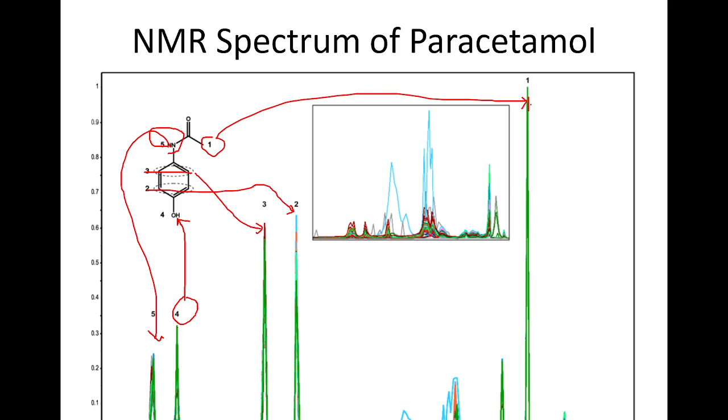And we know that one, we don't talk about the first one. Second and third, okay, we talked about ortho, which is more deshielded because they are ortho to this group. And the OH group is electron giving, therefore we ignore it. Second one is meta to this group, therefore has least effect on it, so is less deshielded.